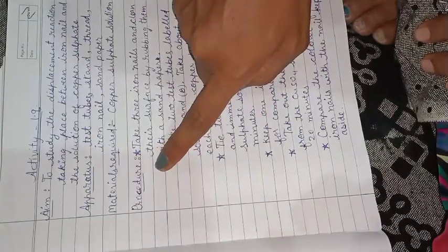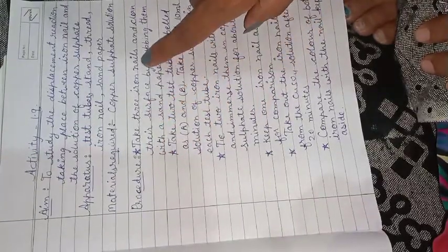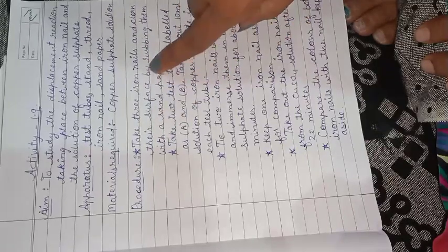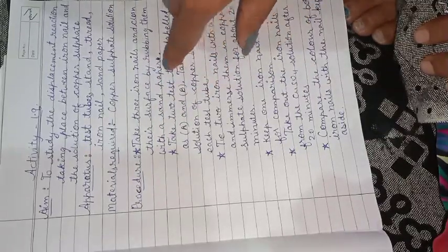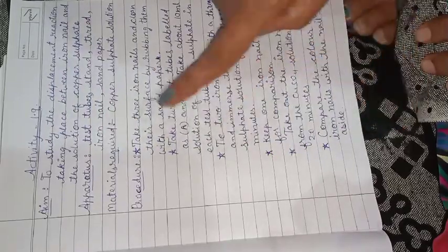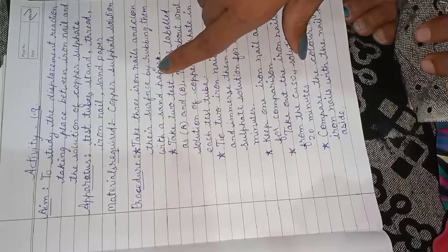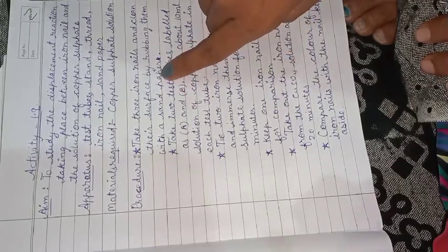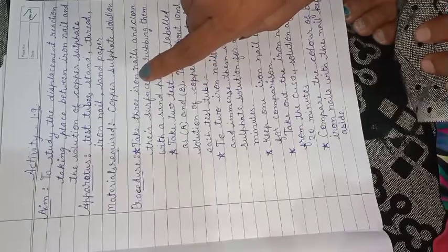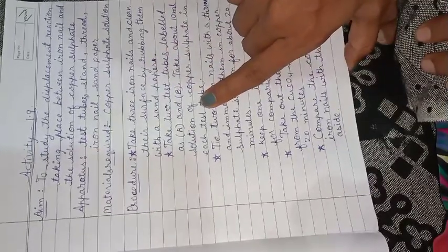So the procedure: what do we have to do? We have to take 3 iron nails and clean their surface by rubbing them with sandpaper. We rub their surface with the sandpaper to remove the iron oxide layer, so we will have pure iron nails. In the next step, what do we have to do?